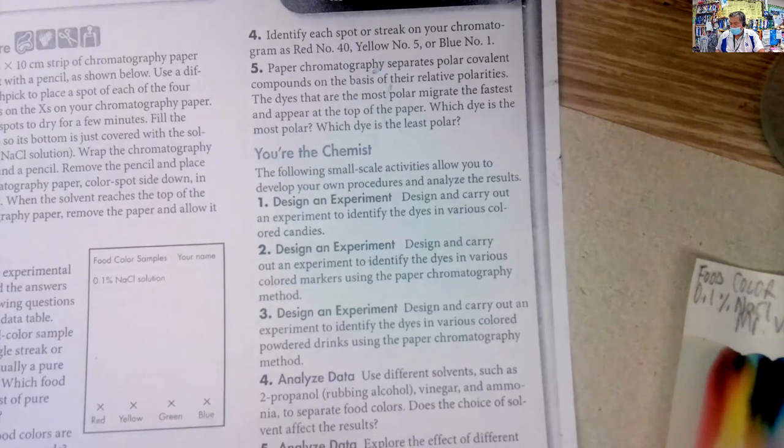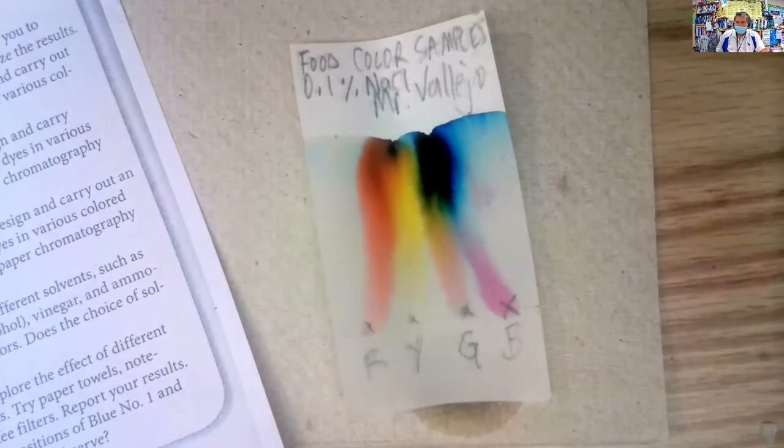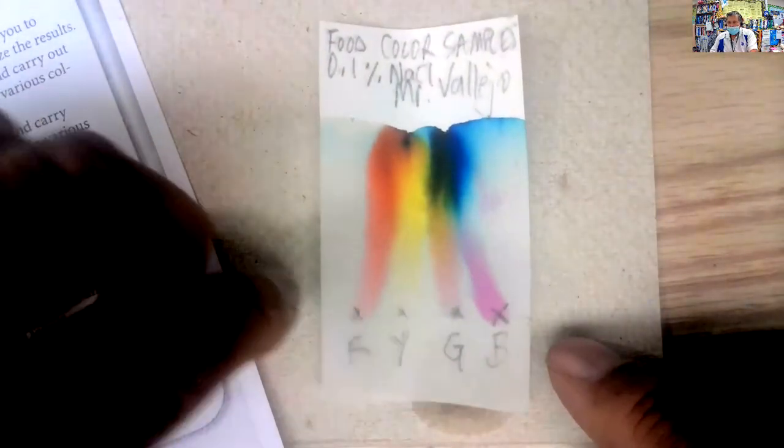And if I directed you to write a full lab report, then go ahead and use a screenshot of our chromatogram. You need a screenshot of that, and then you need the answers to the questions in order to have a complete lab report. So there it is right there. If you want to take a screenshot, then you can cut and splice it and make it look nice, then that would be a good thing.